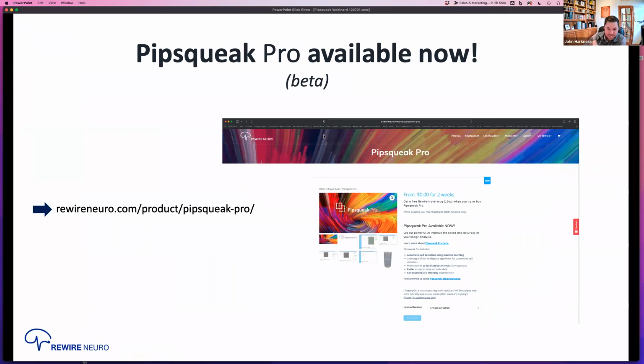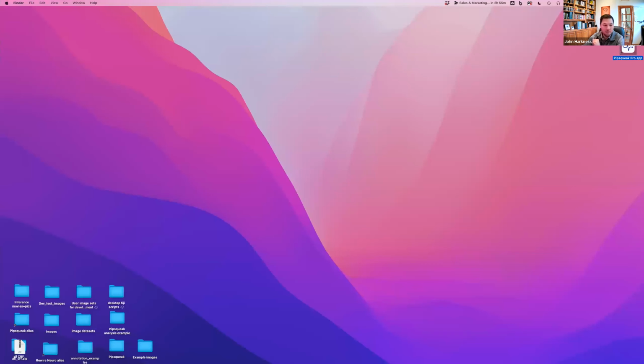So, hey, Hillary, nice to see you here. Can Pipsqueak Pro still handle large images, low magnification? Yeah, really great question. That's something that we're working on. And let me show you what Hillary is asking about here. I'm actually going to open up Fiji or Pipsqueak Fiji and show you how that looks.